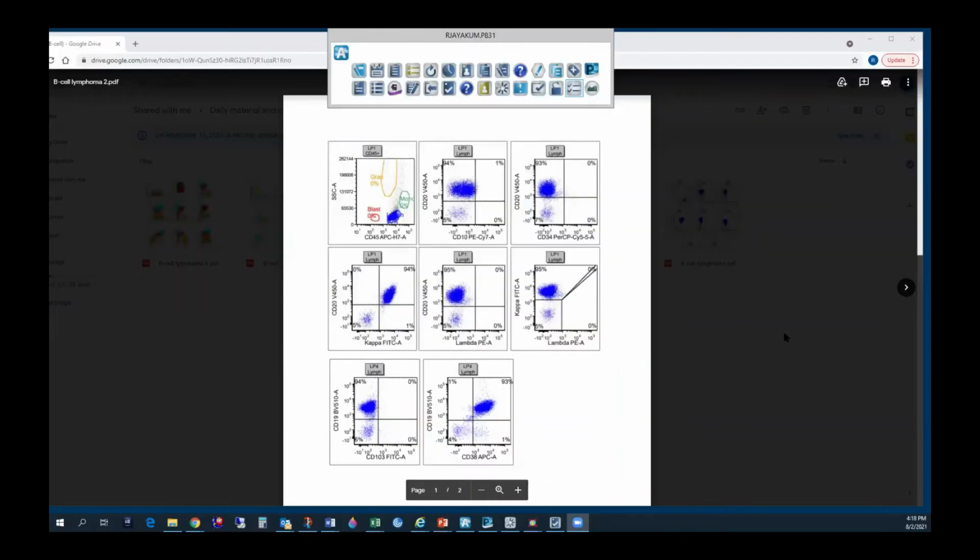And I think what they look for is, for example, for a plot for CD20. In the screen that I'm seeing, the fourth plot of kappa and CD20, there's a small population at the bottom, and right at the border of it, you can see the bigger population is starting, and that's where they placed their lines.